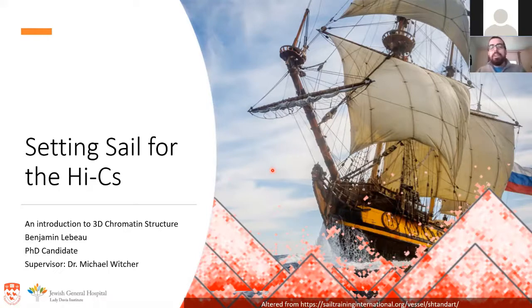Today I'm going to talk about chromatin conformation, how to detect it, how to analyze the data you get from its detection, and how I used it in the context of the project we're working on. But first, I would like to ask a question. It's a simple one.